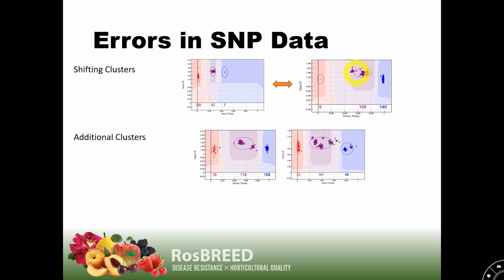Sometimes we get additional clusters, regularly. And sometimes GenomeStudio calls them correctly, but in many cases it might not. This might not be an AB cluster, for instance. And so either we have to know that we can't trust this SNP and throw it out of our data, or we need to make our adjustments to make sure that whatever we get for genotypes are true.